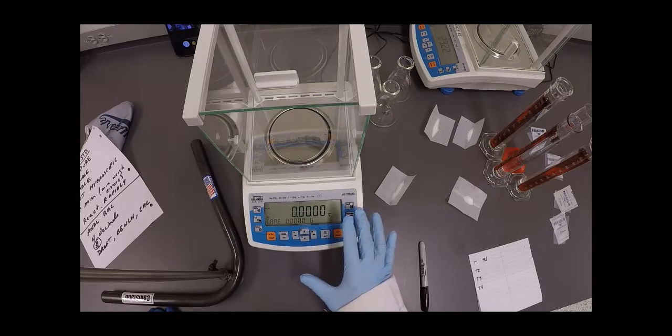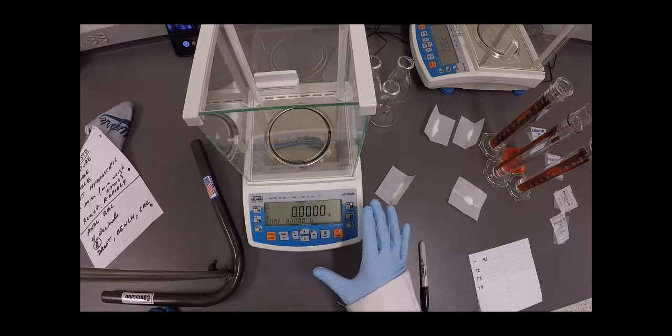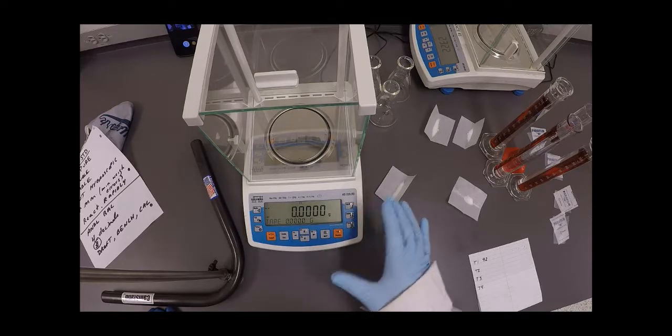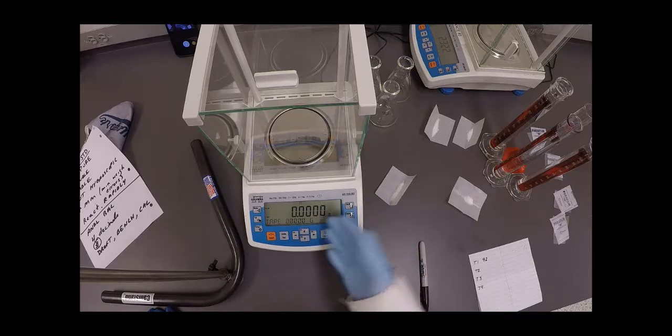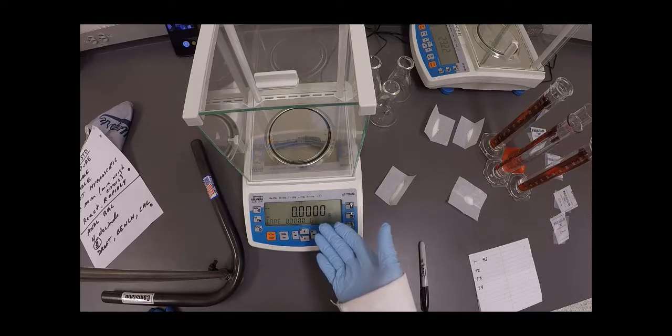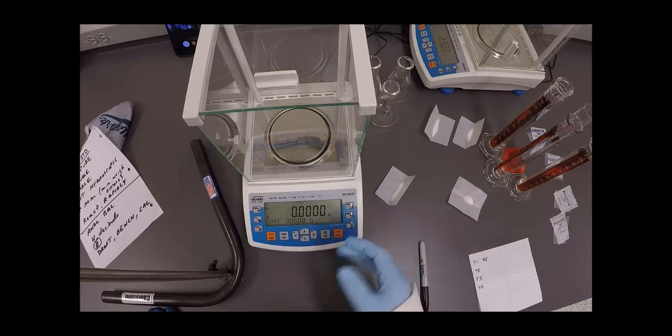So in addition to it being much more accurate, it's also much more expensive. So it's 10 times more accurate, right? It goes from one milligram, which we have in the teaching lab to 0.1 milligram. That's an order of magnitude difference. Well, this is an order of magnitude more expensive.